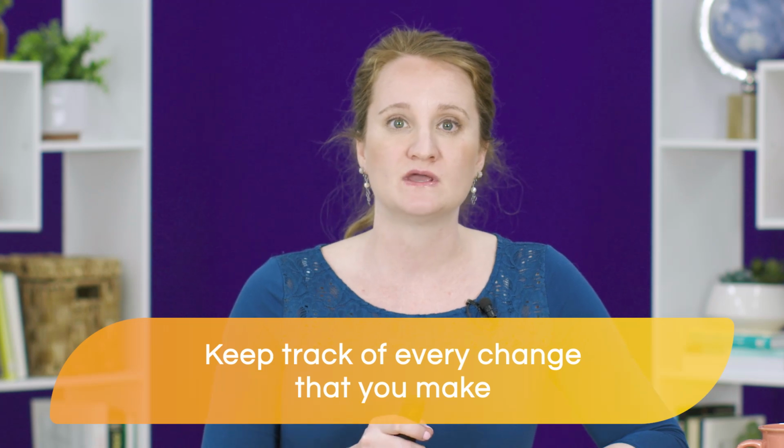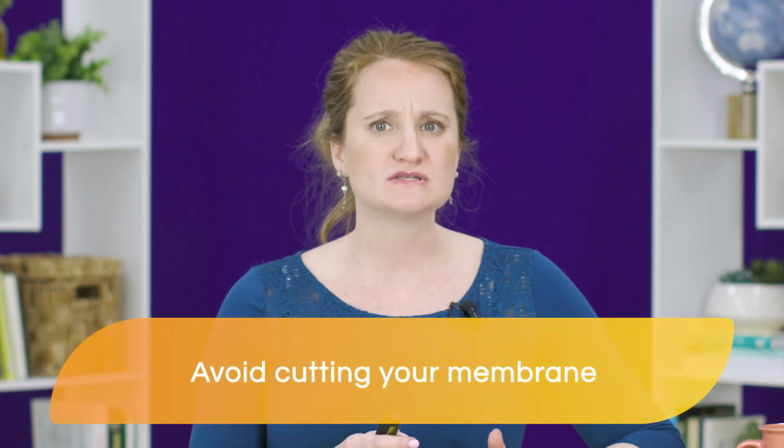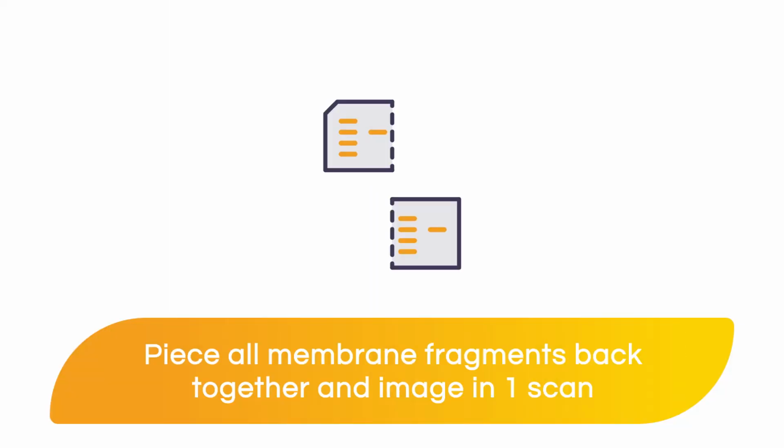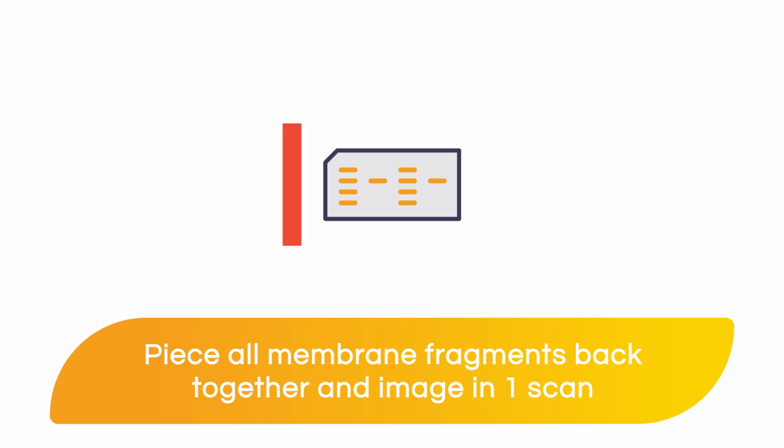Some journals will require that you submit the entire unaltered Western blot when you submit your image for publication. Also, try to avoid cutting your membrane. However, if you do have to cut the membrane, you want to make sure that you piece all of your fragments back together and acquire the image in just one scan. For complete transparency, we do recommend that you always do all of these suggested recommendations regardless of whether or not it's requested.